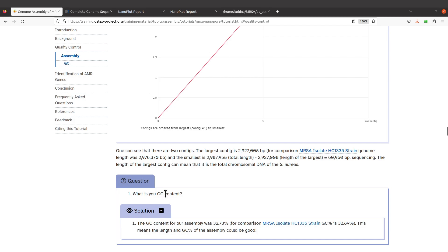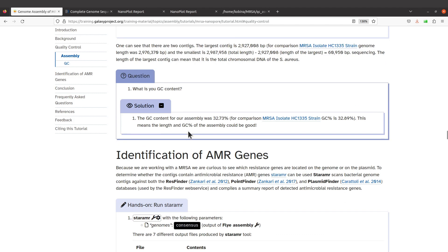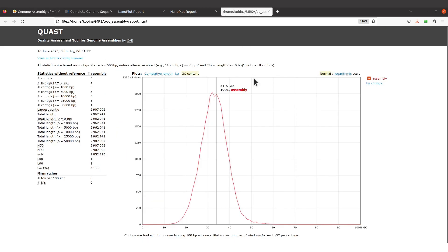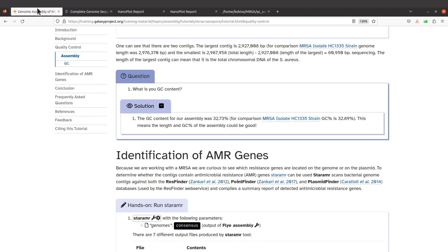You see the GC content for assembly is 32.73 percent, that is what was reported on this page. For mine, GC content is 32.92.